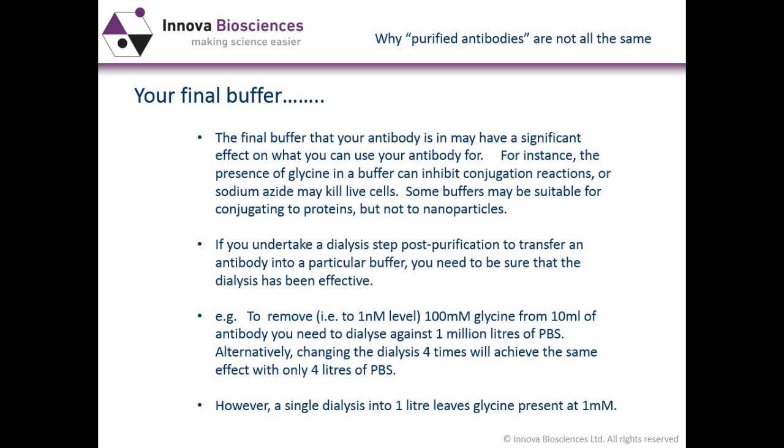I just wanted to mention the importance of dialysis in making purified antibodies. So as I said, when you've purified something on protein A, you might be happy to leave the antibody in the buffer that it was eluted in, that has been neutralized, say with tris. So you might have an antibody that is effectively in a glycine buffer with tris added, and it's at a neutral pH.